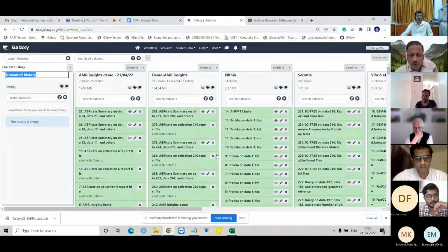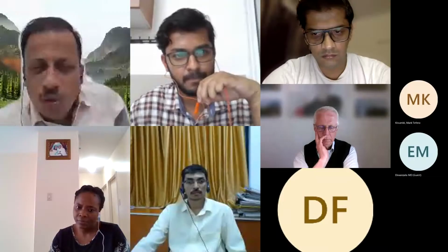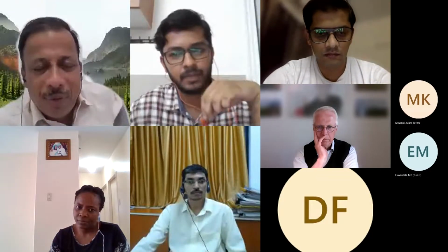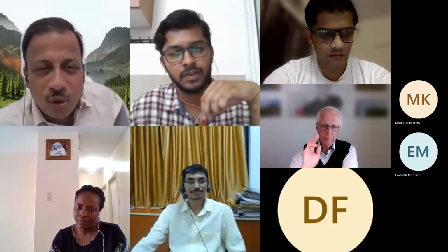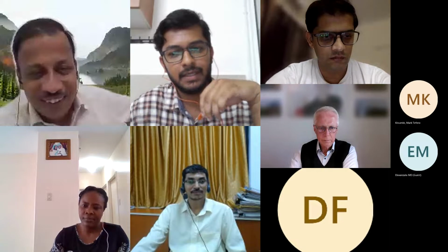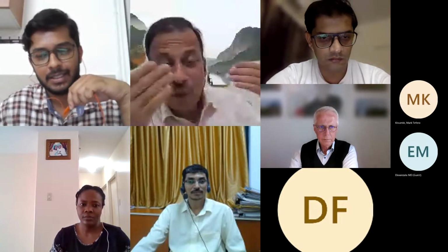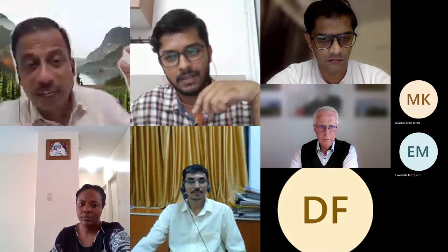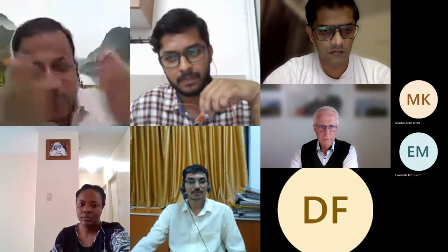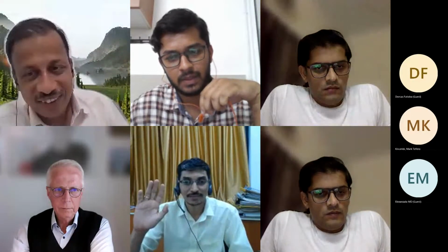Yeah, that was a wonderful suggestion. My question is, when one person can download and upload it, why should the data be split into 2, with 2 different analyses, and then finally you need to merge them again? Because the work with the Excel will be huge to handle the data. Again, when you have 2 different Excel sheets for, say, Salmonella, merging these 2 different Excel sheets will be a complicated process, right? Yes.